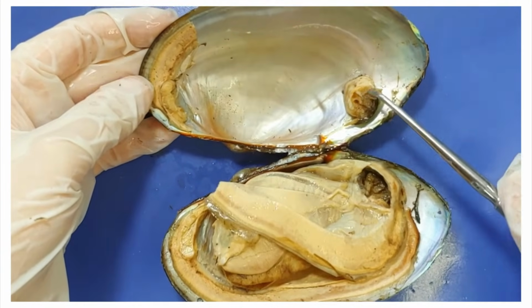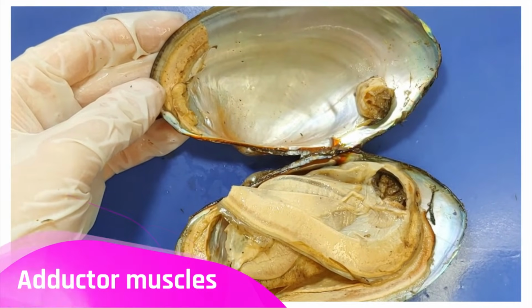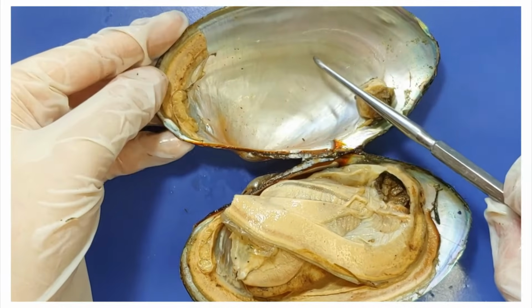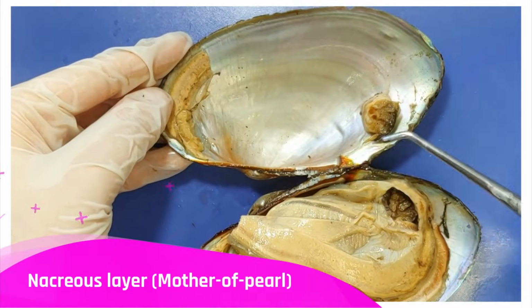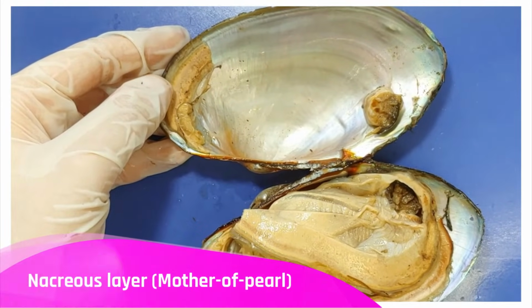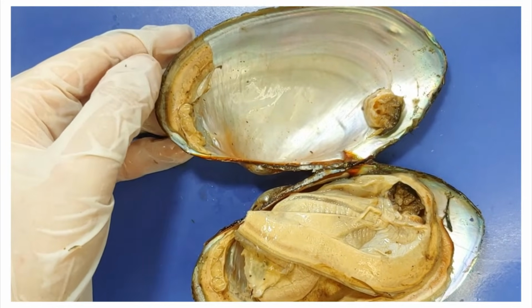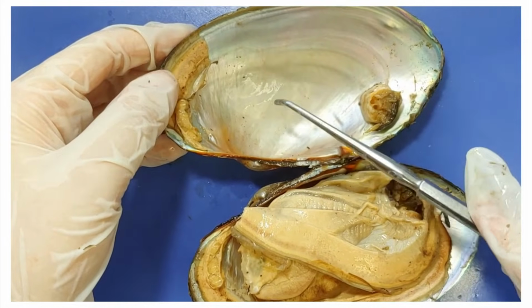This one here and this one here are the two adductor muscles we cut through earlier. Now you can see that the surface here is very shiny. This is called the nacreous layer, or also the mother of pearl for people who are only interested in clams for their pearls. When some debris gets caught in a clam, the same materials that make this layer coats that debris, forming a pearl.